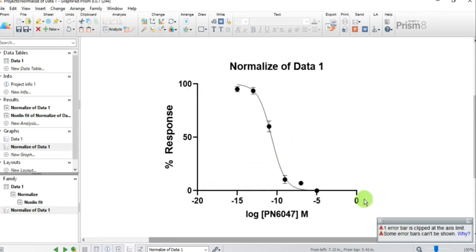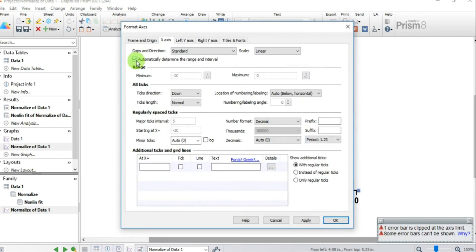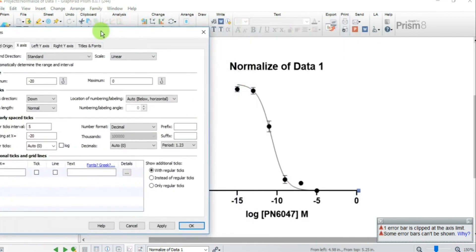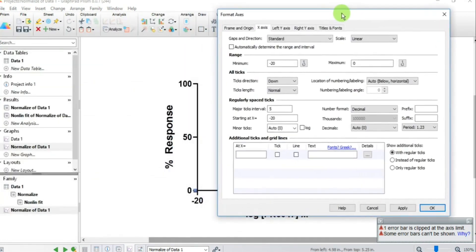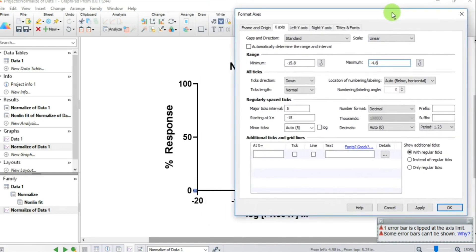The X-axis also needs sorting. Double-click the X-axis and uncheck the automatic range box. Set the minimum to minus 15.8 and the maximum to minus 4.8. These values come with experience from using the software.